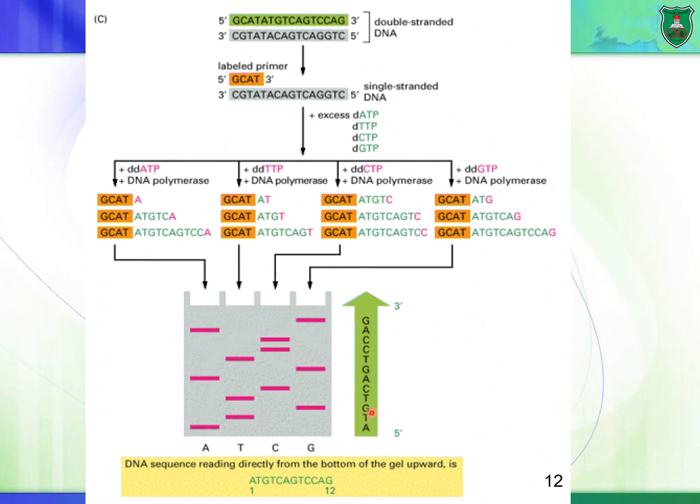So here what I'm doing is I am reading the newly synthesized DNA. Now I forgot to mention, by the way, that the primer is labeled. Okay? So the bands that I see here, I see them because there is radiation, there is a signal that is coming out of the DNA, and it comes out specifically from the primer itself. Okay, good? Great.